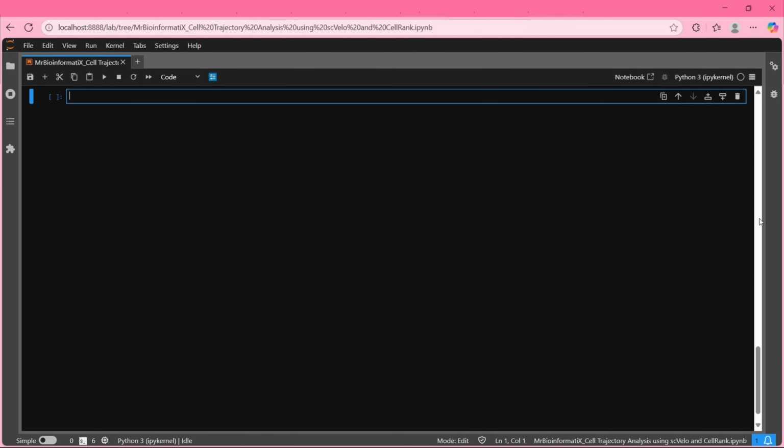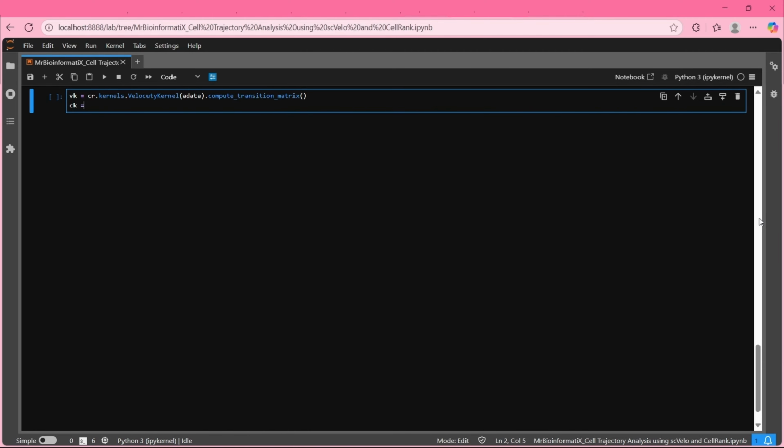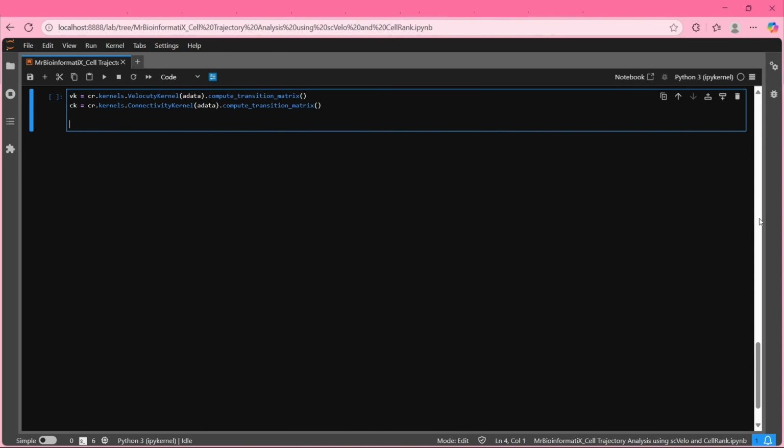So let's build and combine our kernels. And now let's combine them.